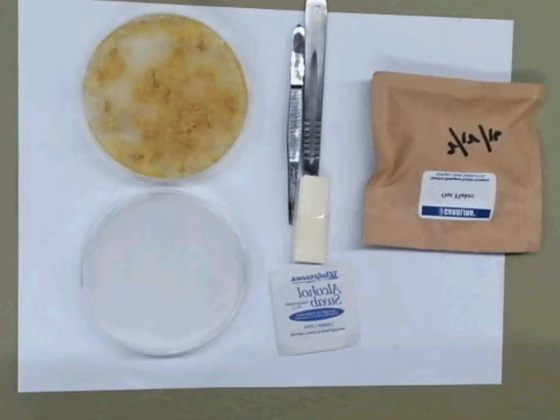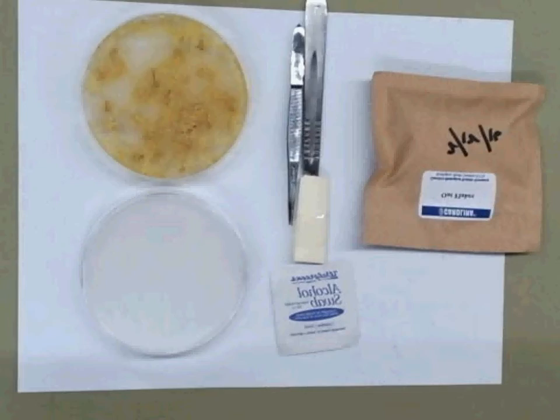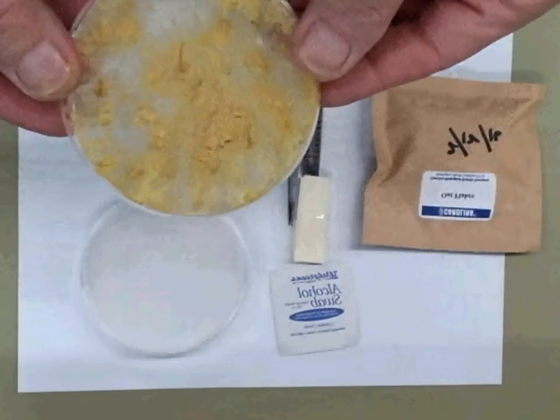In this video, we're going to be learning how to subculture Physarum in the Plasmodium stage. The Plasmodium stage is the active growing stage, as you can see. The mother culture is almost completely filled — let's take a closer look at that and you'll see what I mean.